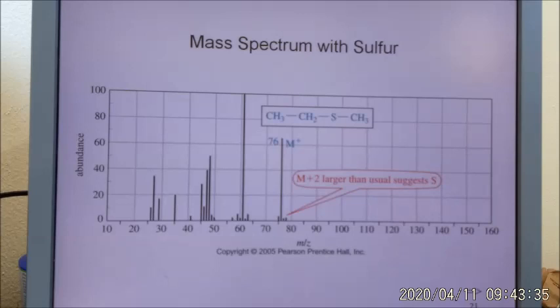And I'm not sure that's going to give us what we want. That gives us 47, 45, 46, 47 right here. So this looks like the 48 and it obtained a proton. But definitely, look at this pattern right there. That has a sulfur in it. This has a sulfur in it.